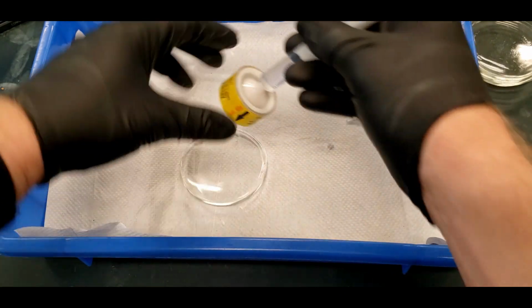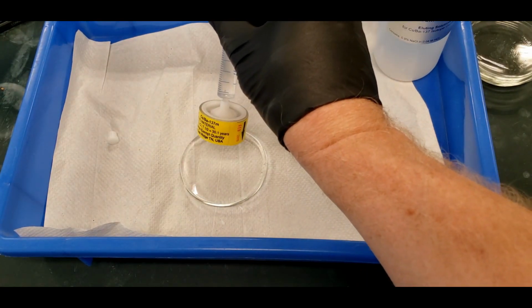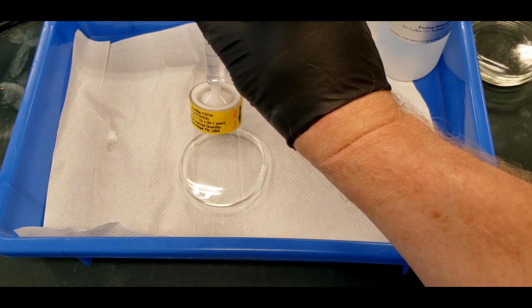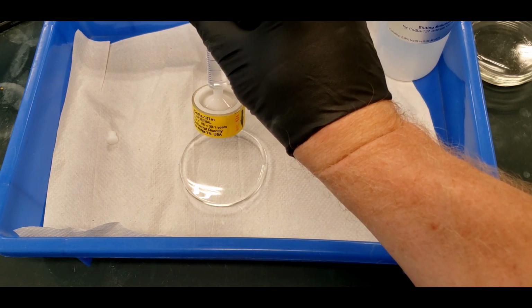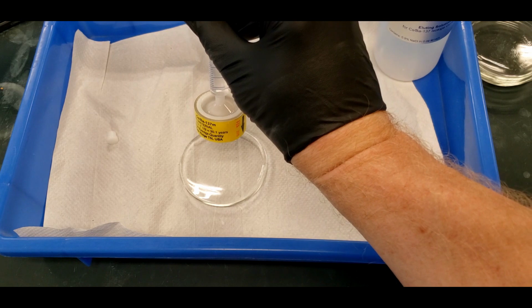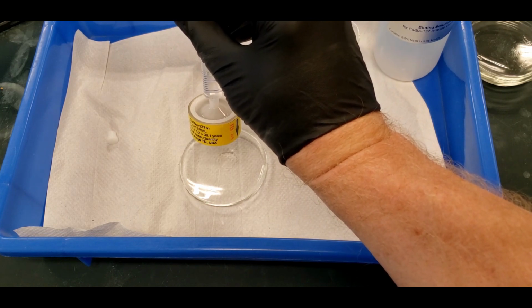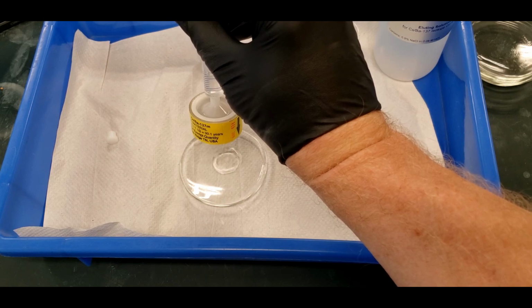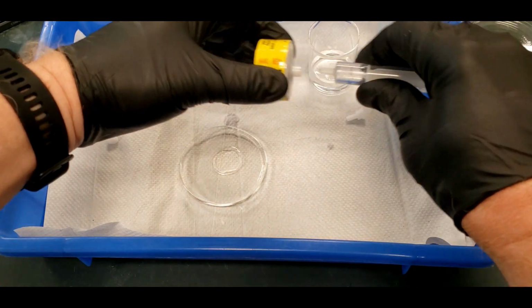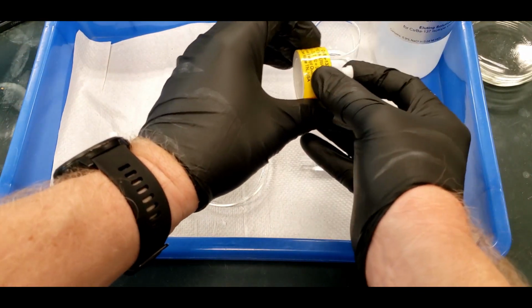Well, I can show it here. Okay, so you don't want to go too quick, but you just put a little pressure behind it. And normally I wouldn't put this high, but I want you to see the drops. Two, 3, 4, 5, 6. I'm going to put a lot of them in there just because it's going to take me a while to get to the next step.